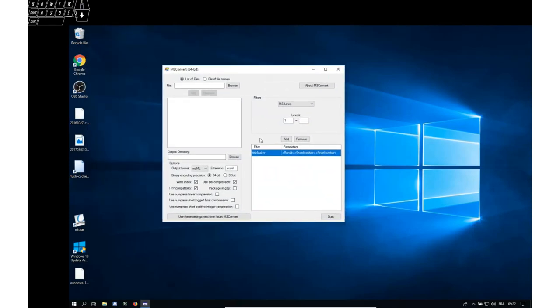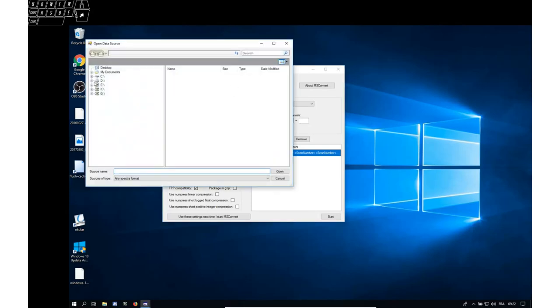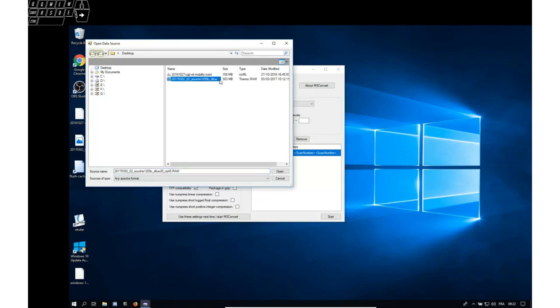Very easy graphical user interface, although you should know that there is also a command line operation of this MSConvert program that provides more opportunities to configure the conversion. For the moment, just select the raw file that you want to select. I will select this one. You can see it is a raw file.